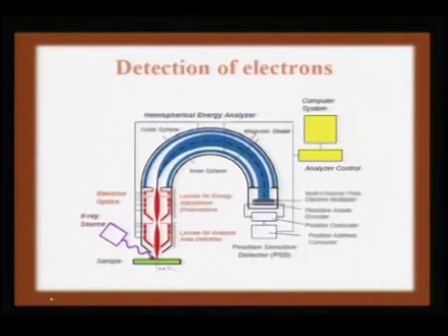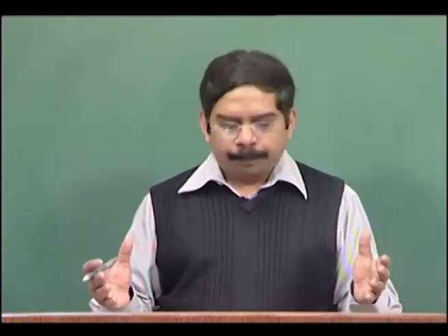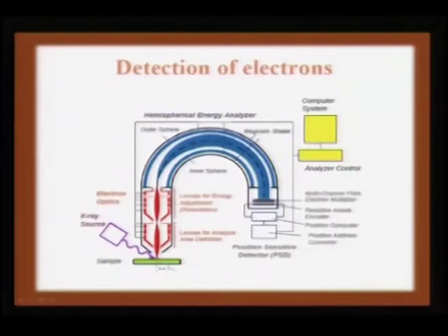Now, how will an X-ray photoelectron spectroscopy chamber look? The analyzer, which analyzes the photoelectrons, is a semi hemispherical chamber, and this is how it goes. You have an X-ray source hitting the target, which is your sample. Electrons are ejected beyond the vacuum level, and these are translated through a semi hemispherical chamber whose inner layer is coated with gold.